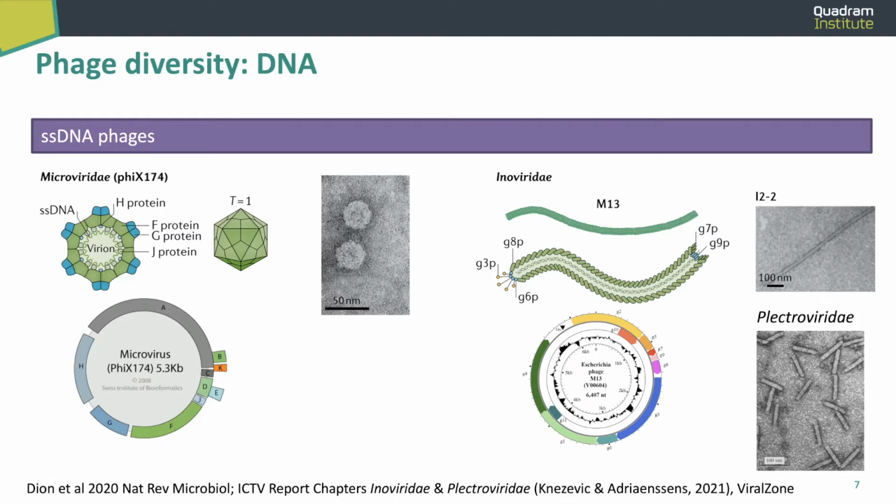If you just do phage genomics, that's not that much of an issue. But as a side effect, if you are working with these types of phages, for example M13 for E. coli, and the Pseudomonas phage Pf1, which is a prophage, you can use this bias to amplify it and make sure that you have enough DNA to sequence. So that's also important to think about when we're talking about phage diversity.